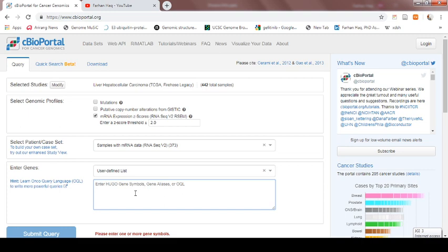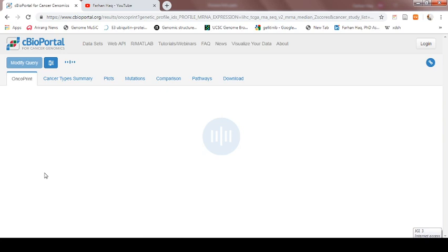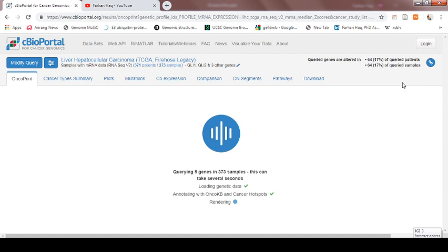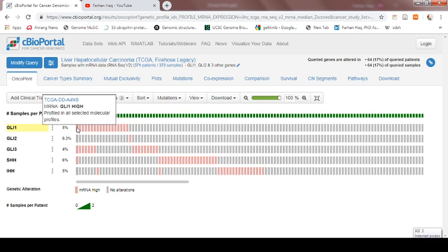Here we will write the gene names: Gli1, Gli2, Gli3, SHH, and IHH. After writing these five genes we will just submit the query. Now after clicking submit we will get an OncoPrint — this graphical interface is known as an OncoPrint. Here you can see that those five genes Gli1, Gli2, Gli3, SHH, and IHH are arranged row-wise, and each column represents one patient. For example, TCGA-DD-A4NS is the first patient name, the other one is AA1D, then A3M9 — these are different patients.